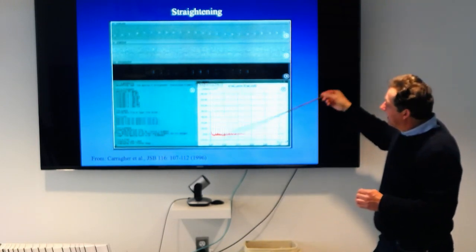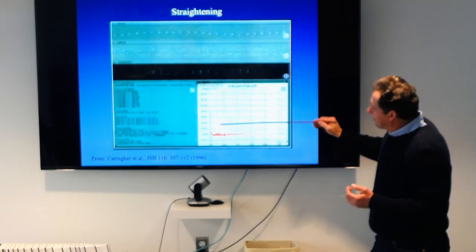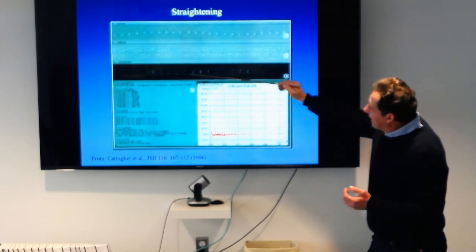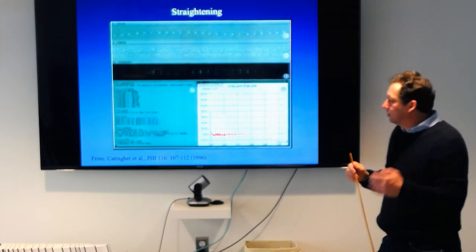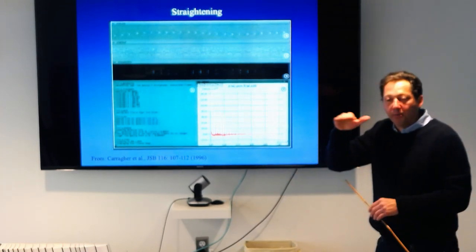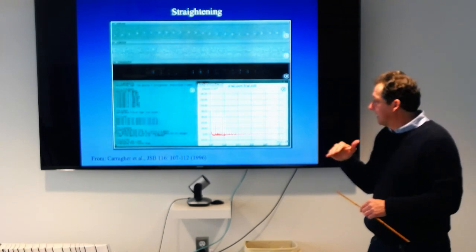Straighten the images. Then, for this particular specimen, we find all the positions of the layer lines here, and that's where we started to see the spacing between layer lines, to start putting numbers that will tell you what the selection rule is.